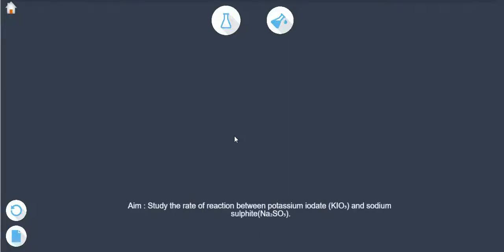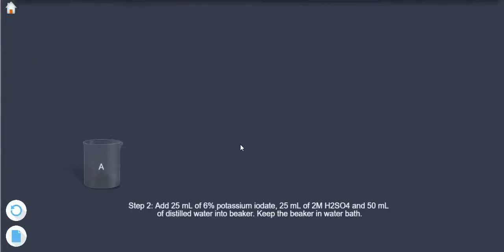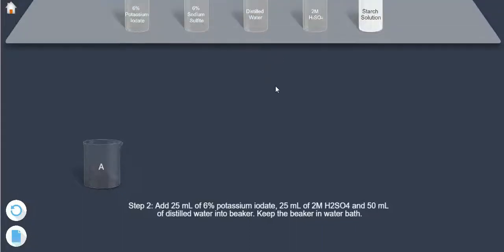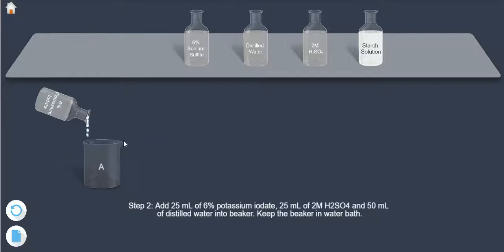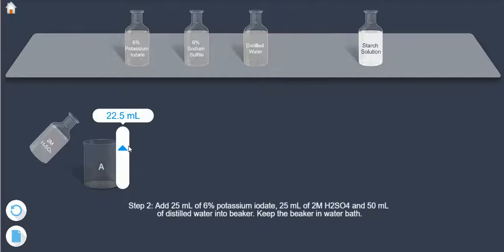Study the rate of reaction between potassium iodate and sodium sulfite. Step 1: Take a 250 ml beaker labeled as A. Step 2: Add 25 ml of 6% potassium iodate, 25 ml of 2 molar H₂SO₄, and 50 ml of distilled water into the beaker. Keep the beaker in a water bath.